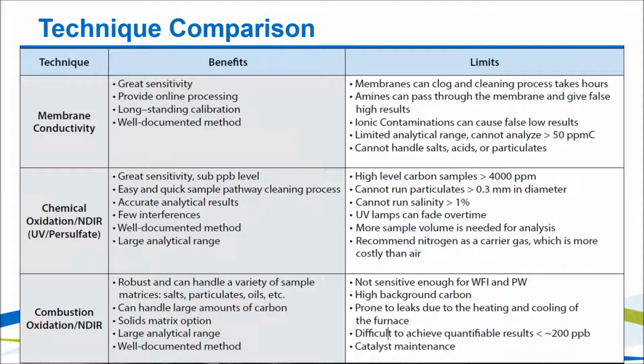The reason I say that is air and oxygen do work. You can run it through it, but with the UV sodium persulfate process, you're going to oxidize your air. So you're going to convert that O2 to O3, so ozone, and then you're going to have ozone venting out into your laboratory, which is not good for your respiratory system, and we want everyone to be safe. You can get around that. There are ozone scrubbers, so some customers have that. But we do still recommend nitrogen just because it's the safest bet, which can be more costly, of course, than using air, filtered air.